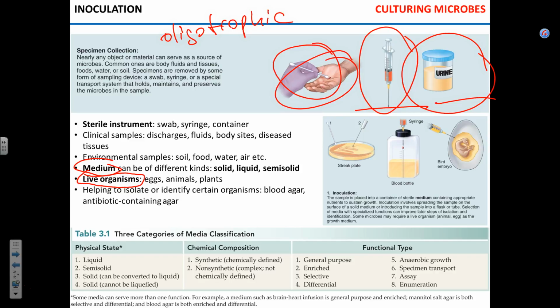Okay? For instance, anaerobic bacteria will not grow on that TSA plate. They're going to die because of the abundant oxygen. So whatever anaerobes you had on the skin, bad luck for them. You see? Some bacteria are extremely tough to cultivate. You really just cannot put them out there and grow them.